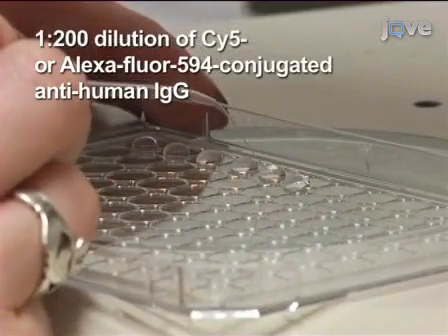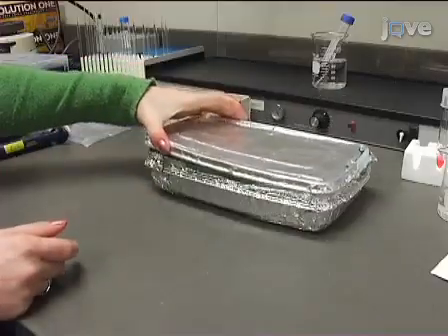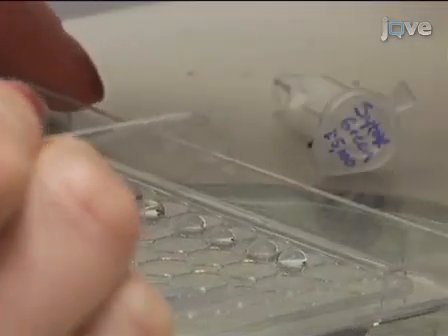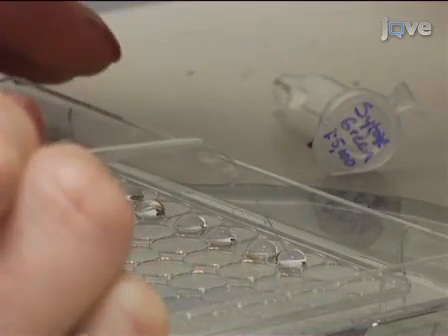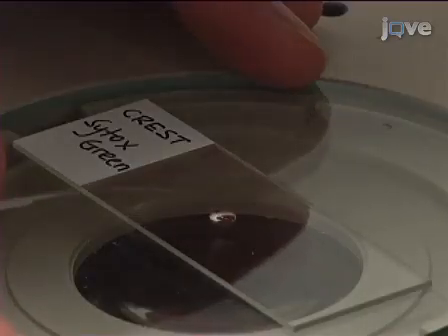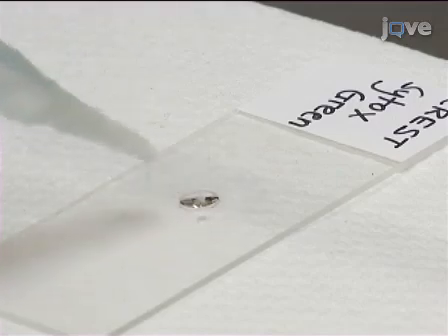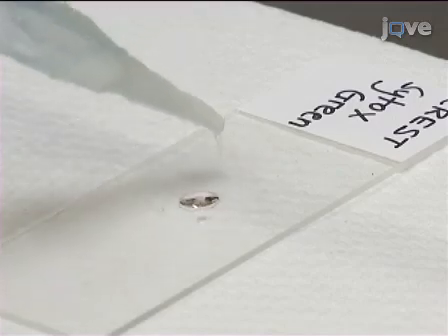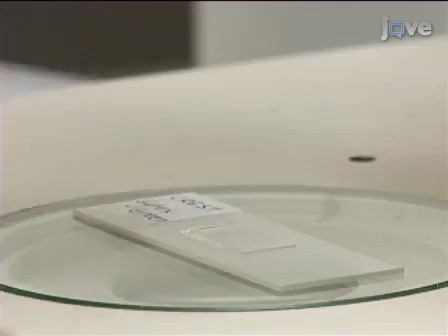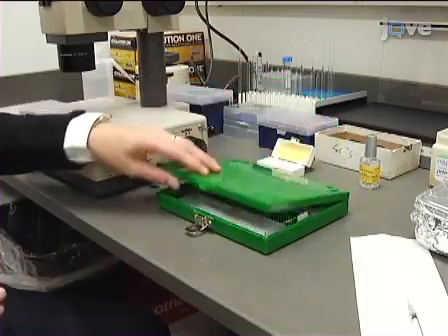Transfer eggs to a drop of blocking solution containing fluorophore conjugated antibody and incubate for 1 hour. Wash twice in blocking solution. To detect chromosomes, incubate in a 1 to 5,000 dilution of Sytox green in blocking solution. Mount samples in 5 microliters of VectaShield. Put 4 small spots of petroleum jelly at the intended position of cover slip corners to prevent crushing of the eggs. Place the cover slip and seal with nail polish. Store in a slide box at 4 degrees Celsius until processing via confocal microscopy.